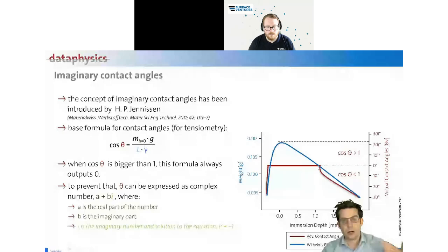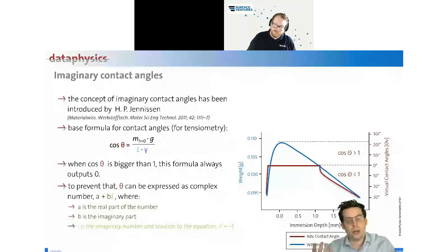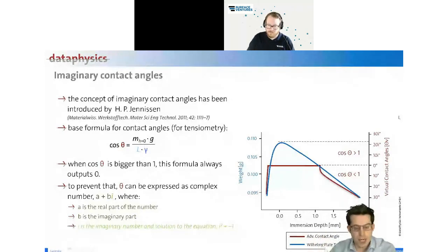So this means you cannot quantify whether this sample is more hydrophilic than the comparison sample. So you have to write for 10 samples, oh okay, contact angle is 0, I'm sorry, now my experiment is done. I don't know which of my coatings or which of my surface engineering was the most successful to make it even more hydrophilic. So let me go one graph further here.